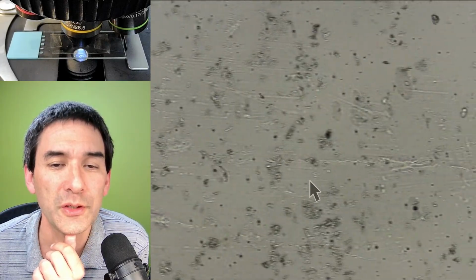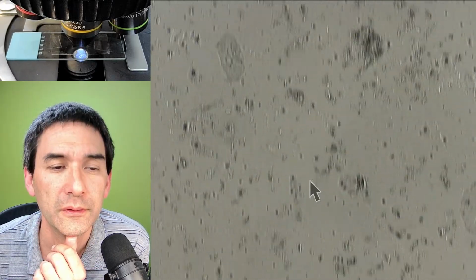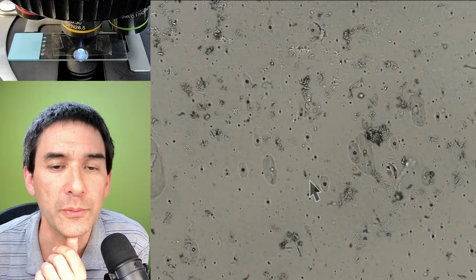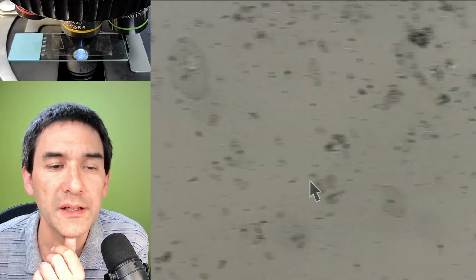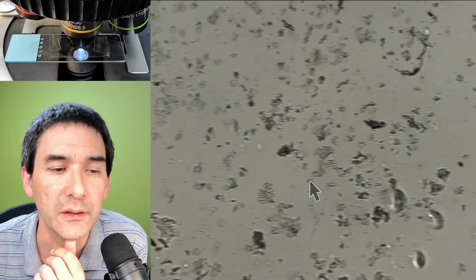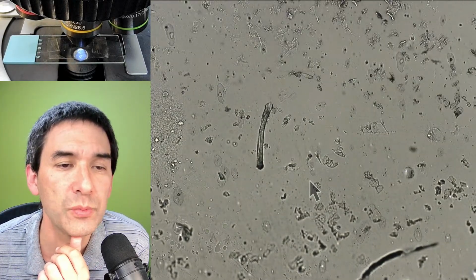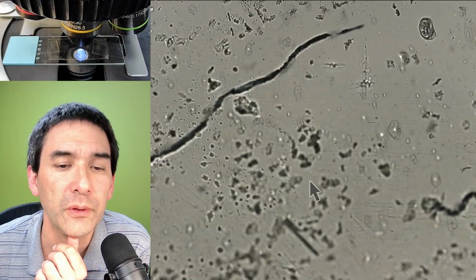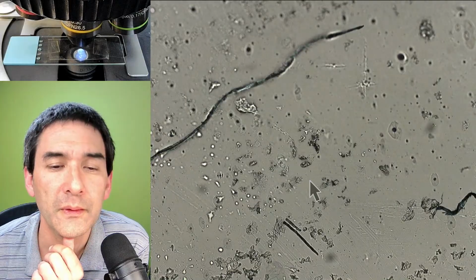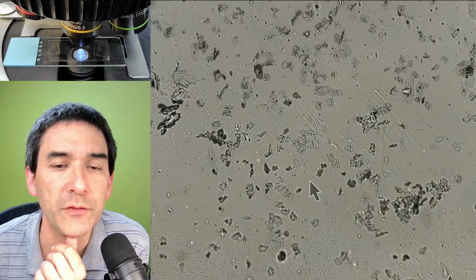You always want to remember a little bit where you found the things from before. I wasn't quite sure whether what we saw before actually was one or not. But essentially, if you don't find one, you just repeat the whole thing again until you're more successful. That's what I mean when I say you do need a little bit of patience.